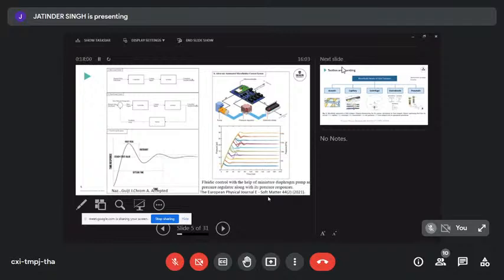So the syringe pump doesn't have as much pulsing as a peristaltic pump has, but because it's a stepper motor, there is still some movement in there. And another problem with the syringe pump is it builds up a pressure. That pressure doesn't disappear when you switch off the pump. So stopping of a syringe pump doesn't mean your flow stops. Your flow only stops when the pressure has been dissipated, which could easily be 5 minutes.